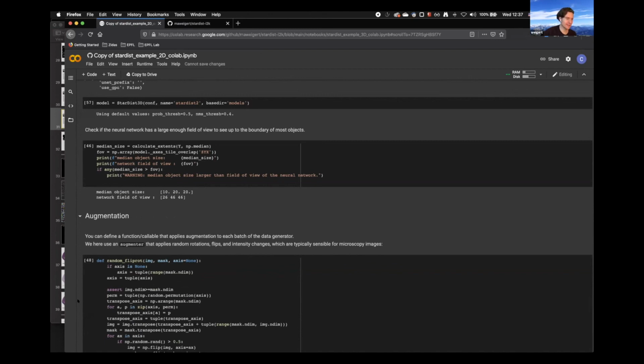Yeah, what you would do then, but that is research, right? That is not something that can be tried and tested. But of course, it's super interesting if you have like 3 channels and 2 of them are important and the other one is super non-important for your decision. You could imagine having a kind of channel-wise attention where you multiply a weight for each channel, which tells you, is this important or not? And put that as the first layer and make these weights trainable, right? And you can do that now with Keras. You can stack models on top of each other. So you could use that layer as the first layer and then stick a StarDist model on top of that. That should work. But you have to dig into the code.